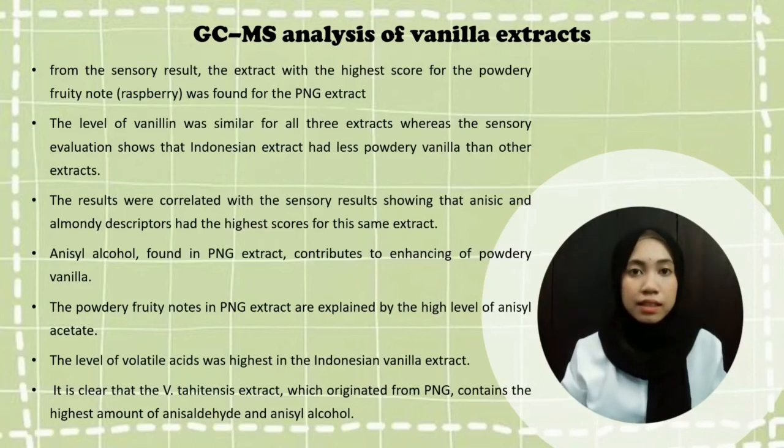GCMS analysis was done firstly for the pure vanilla extract, and secondly, the same extracts were analyzed by the GC-MS/O technique. This technique resulted in odor description by highly trained sensory scientists. GCMS analysis of vanilla extract.